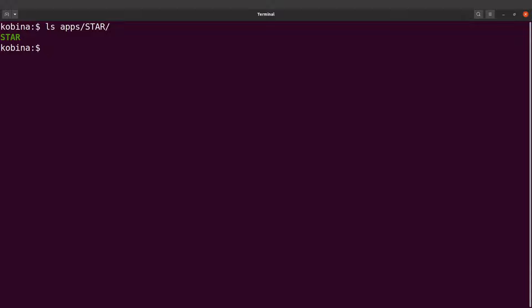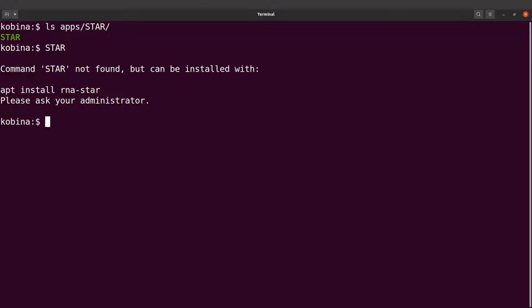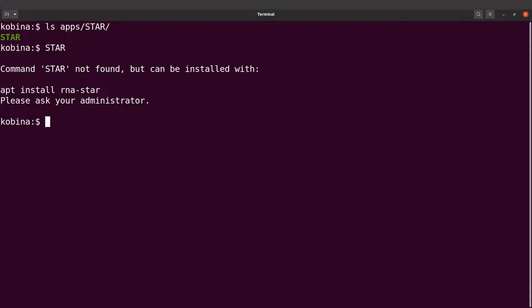With our current setup, we always have to specify the path to the STAR executable. But on a Linux system, it's possible to configure it so that you can only use this name here to call the file. But with our current setup if you do this, we will have this message coming: command not found. So what we are going to do is to configure our system so that we can just use the name here to call this file.